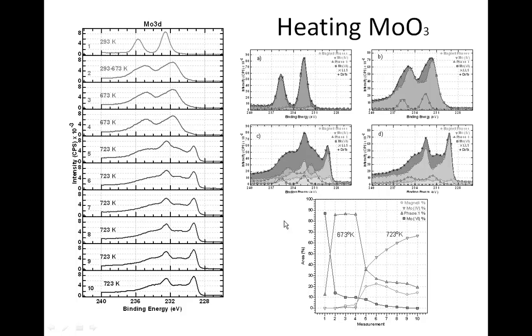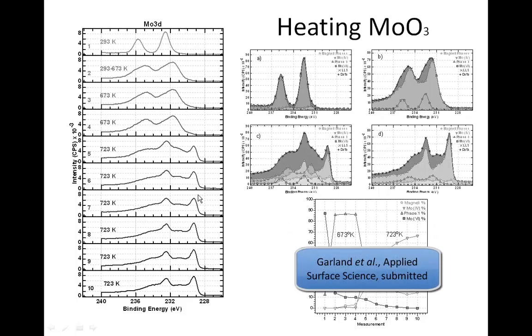But the same technique, with a little bit more work, can be used to analyze data sets that contain 3 and 4 dimensions or more. It takes considerably more work the higher the dimensions we have, but nevertheless it is possible. And here's an example of a data set that is analysed by the same techniques applied to spectra that were measured from molybdenum trioxide when heated.